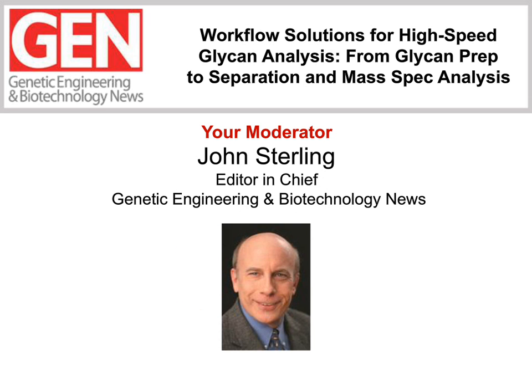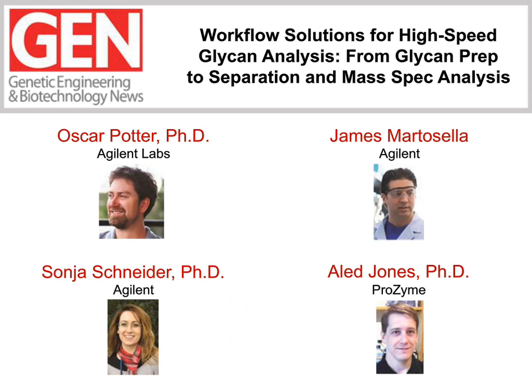The analysis and assessment of glycosylation in proteins is one of the most critical steps in the development of biological drugs. Efficacy, safety, bioactivity, half-life, and immunogenicity are all dependent on the glycosylation pattern. Today's webinar has been designed to show you how to establish and carry out an efficient and economic workflow for successful N-glycan analysis. Our panelists are going to focus on the key steps of sample prep and separation optimization.